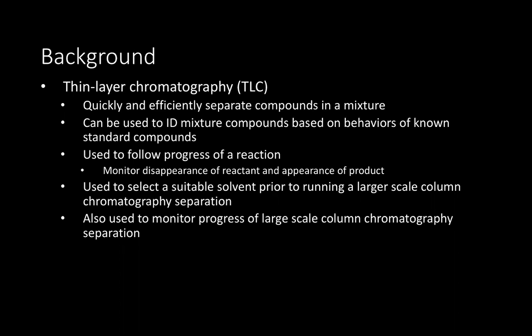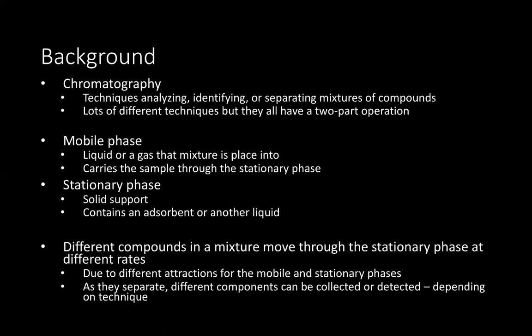Usually, this is also a technique that we use to select a suitable solvent prior to running a large-scale purification in what we call column chromatography separation. And we can also use TLC to monitor the progression of those purification column chromatography separations.